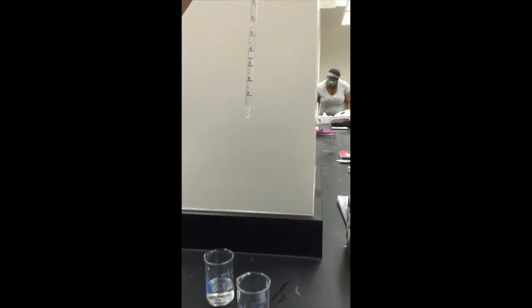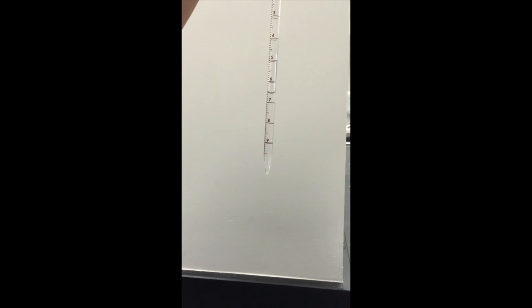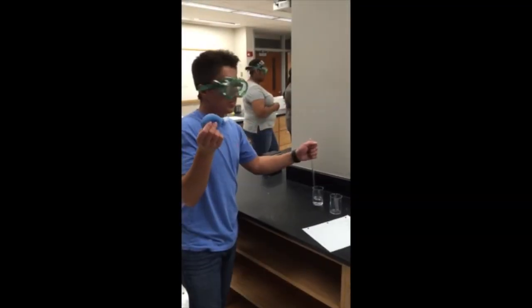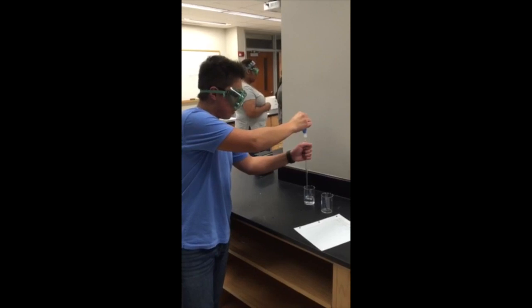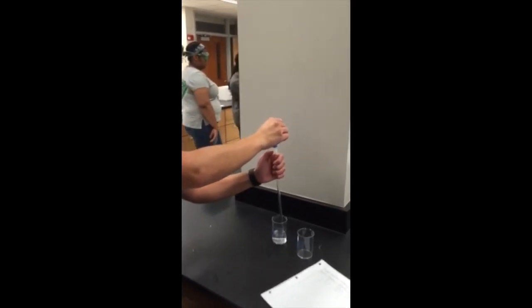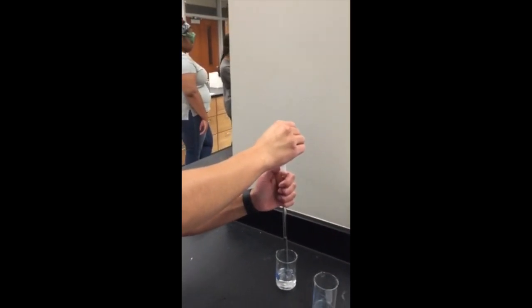From here we can see that it is 6.65. Now we take our final volume, subtract our initial volume from it to get our delivered volume, which is 2.64 milliliters. First you squeeze the bulb and place it on the pipette to get some water. You stop it at your desired amount, and you take off the bulb and place your thumb on it.